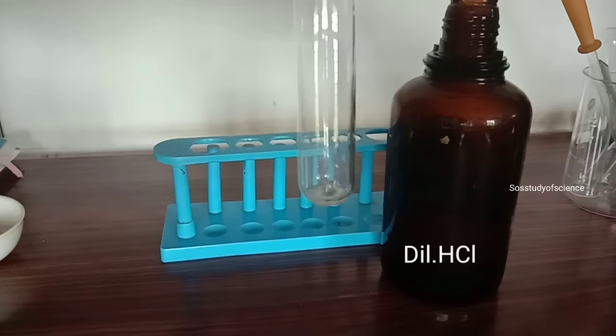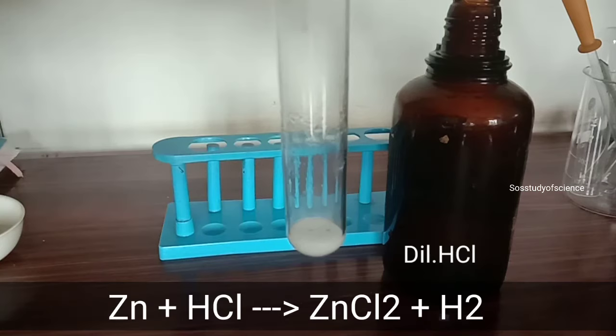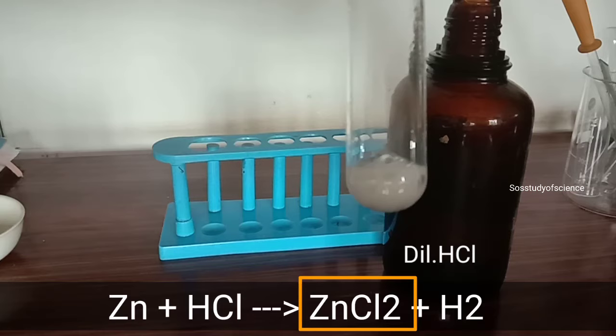You can see zinc metal is vigorously reacting with hydrochloric acid and it forms zinc chloride salt. Along with this, hydrogen gas is also liberated.